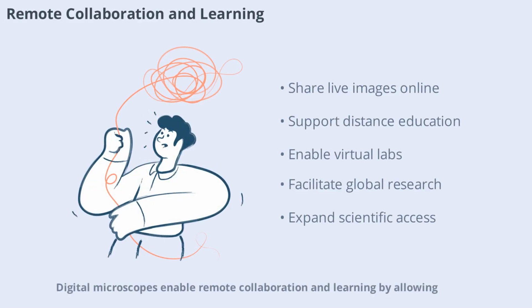Digital microscopes enable remote collaboration and learning by allowing users to share live images and videos over the internet. This is especially useful for distance education, virtual labs, and international research projects. Teachers and researchers can demonstrate techniques, discuss findings, and work together in real time, regardless of location. This connectivity expands access to scientific exploration and education worldwide.